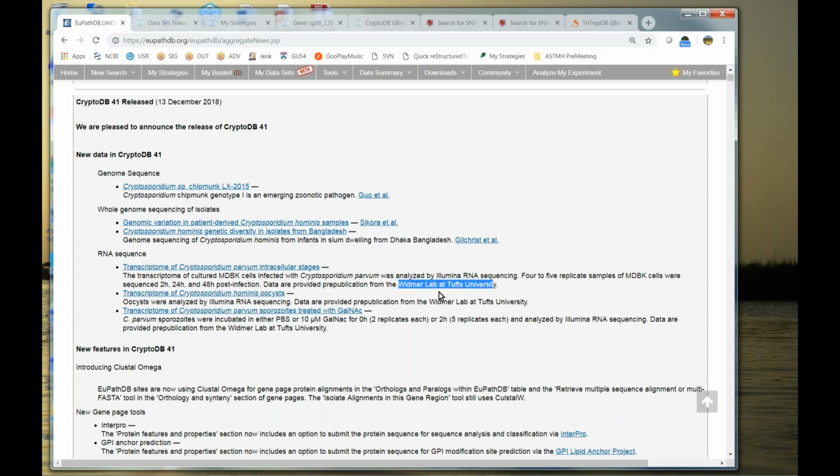And so all of our RNA sequence data is run through a pipeline that aligns the reads to a reference genome, determines expression values, and then calculates differential expression when appropriate. And then we use those analysis results to build genome-wide searches of these individual data sets. We represent each gene's expression pattern in these data sets on gene record pages. And then we offer dynamic visualization of the data aligned to a reference genome in a GBrowse, right? So those are the 3 basic ways that you can mine this data. And let's take a quick look at each way that you could mine this data.